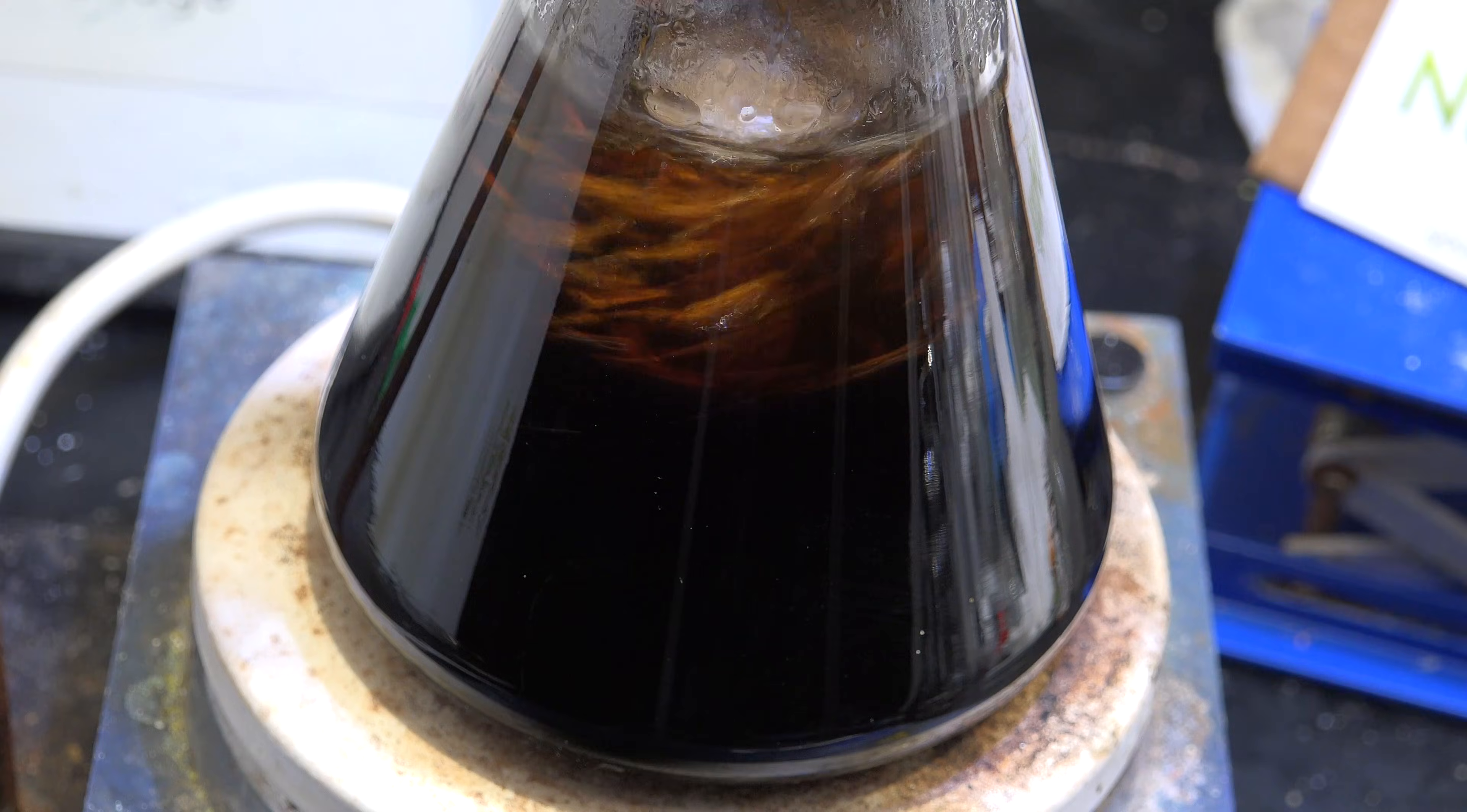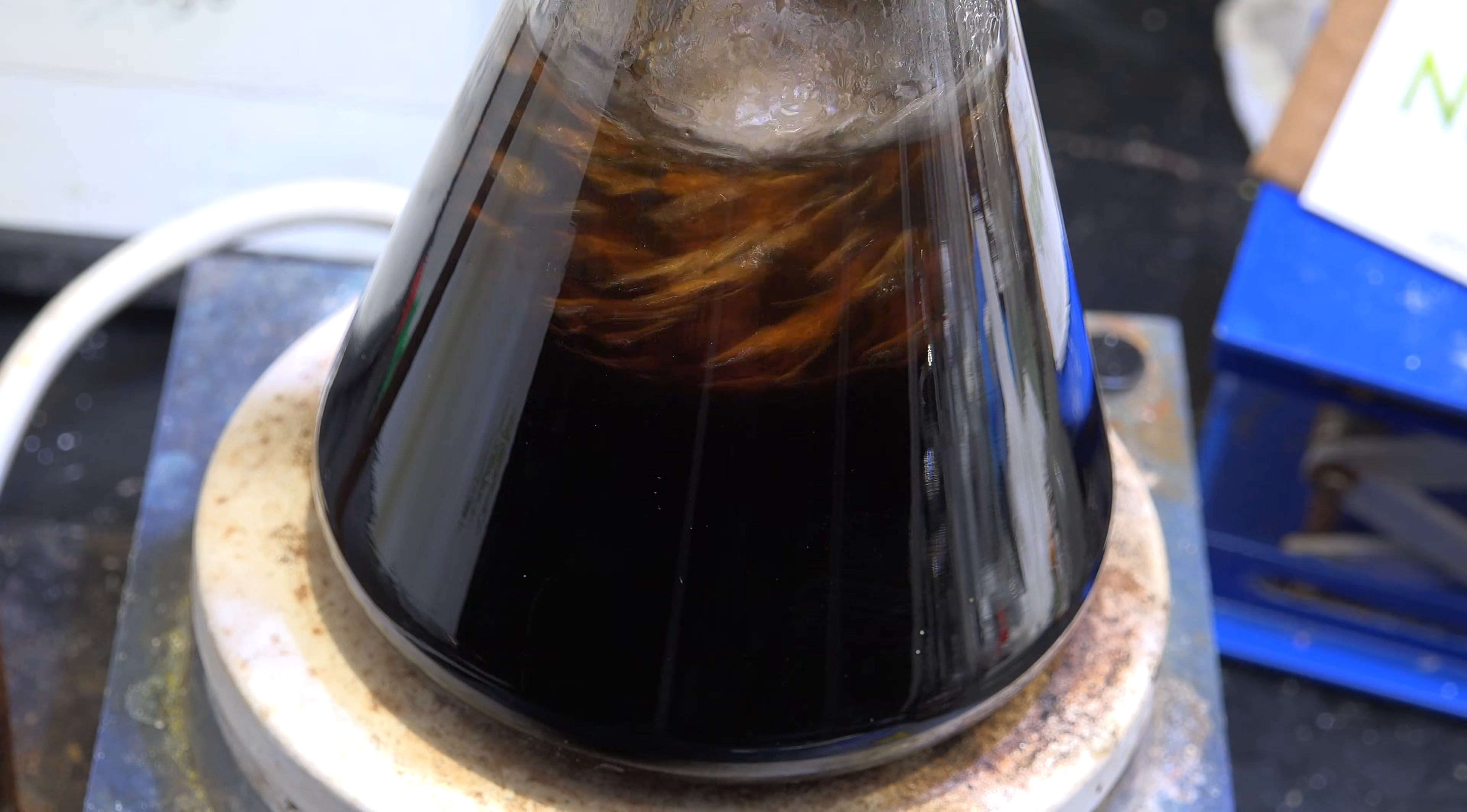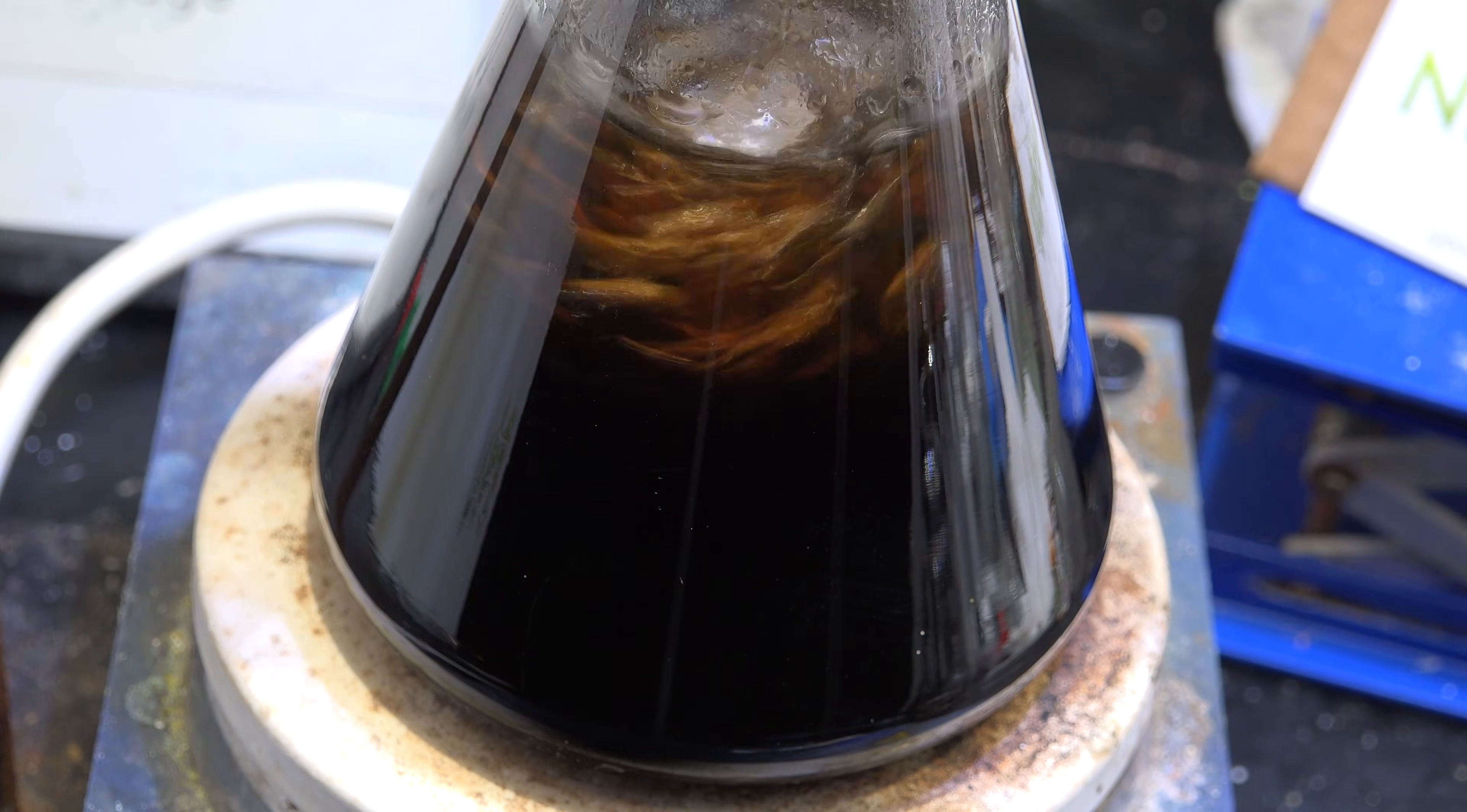Now you might be wondering why I'm refluxing and not distilling. Unlike bromoethane, bromohexane has a high boiling point, similar to that of hexanol. So we can't just distill it out or we'd lose our hexanol as well. It's therefore preferable to just reflux everything and let the reaction go to completion.